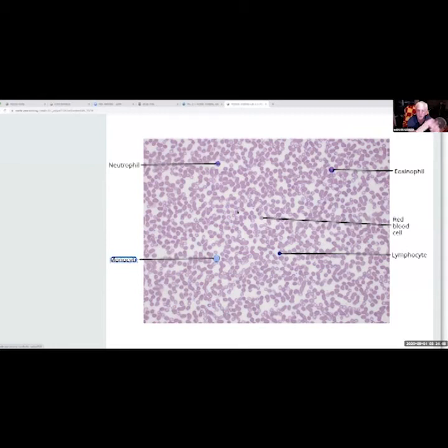They're designed strictly to transport oxygen and carbon dioxide. Whereas the white blood cells have a nucleus and our whole immune response. But that's how you can easily tell the difference between a white blood cell on a blood smear and a red blood cell. Okay.